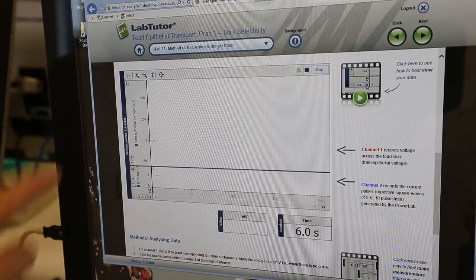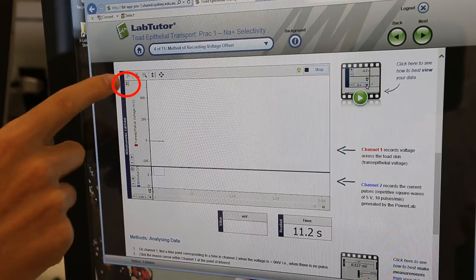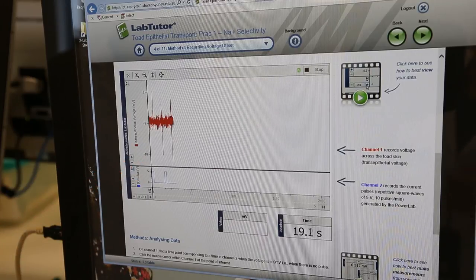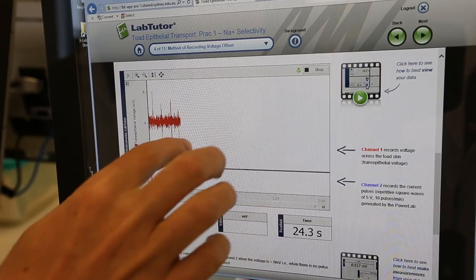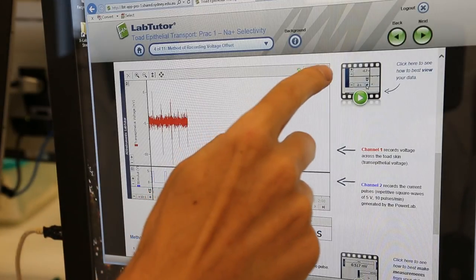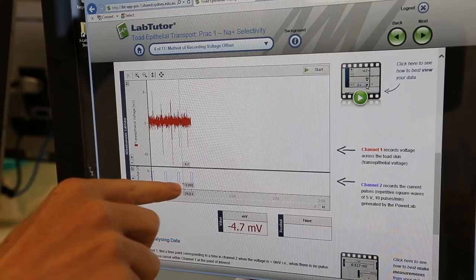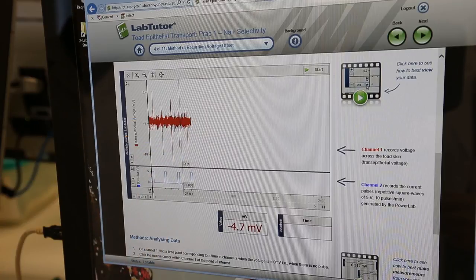If the trace is too small, press the Auto Scale button in the top left-hand corner of channel 1. The same can be done for channel 2. This is the potential across the chamber with no tissue in place, and represents the offset voltage. To measure the offset voltage, press stop and place the cursor in a part of the trace where channel 2 reads 0 volts. In this example, we have minus 4.7 millivolts. Your chamber is now set up and you are ready to proceed.